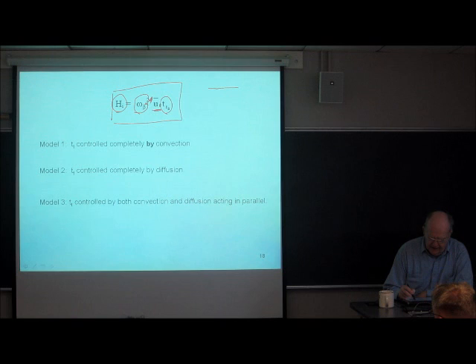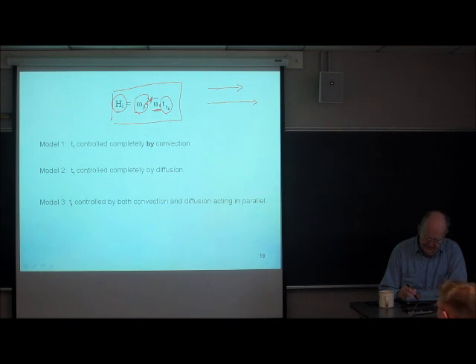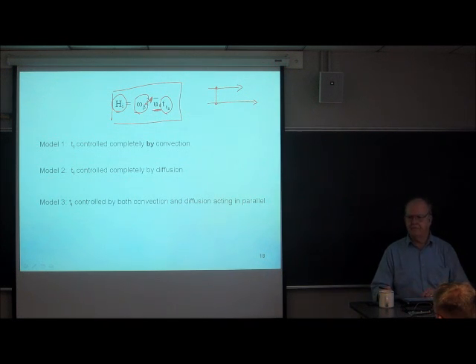So if down the column direction is that way, and this is one flow stream, and here's the flow stream that has the average velocity, T sub T is the transfer time to get from this flow stream over to that flow stream. So this is what's going to generate the broadening by the flow-induced dispersion process.